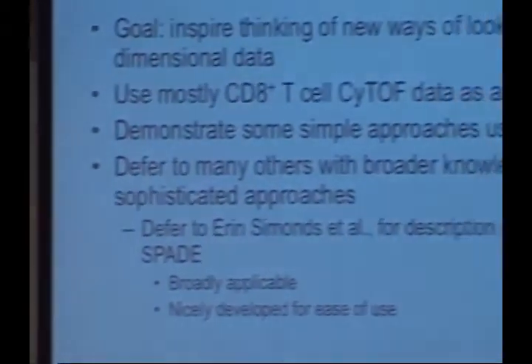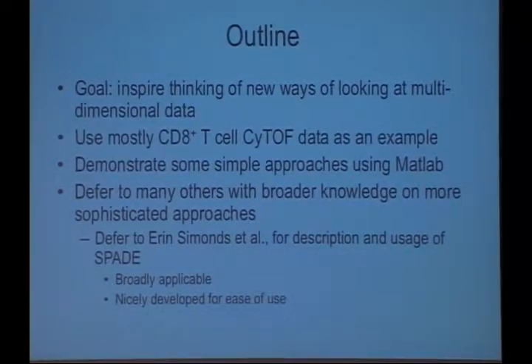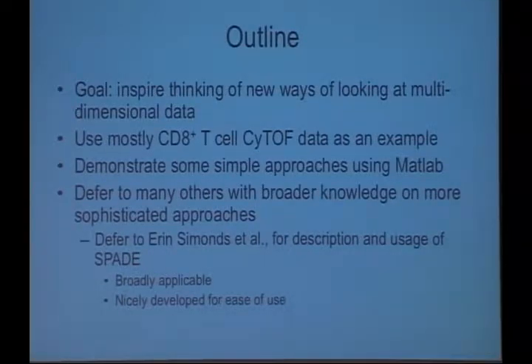Then I'm going to build on the data that I introduced yesterday with the CD8 positive T cell CyTOF experiments I was doing. Most everything I've been doing is in MATLAB, just because I have dedicated some time to learn how to use that. But this could be done in any platform that can deal with matrices of numbers. And as I was saying, I'll defer to many others around here with broader knowledge of other sophisticated approaches. One of those is SPADE, which is very nicely implemented and broadly applicable. It's being used a lot, as you've seen, and definitely something that we should continue to use as well.